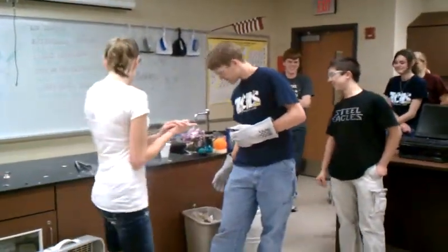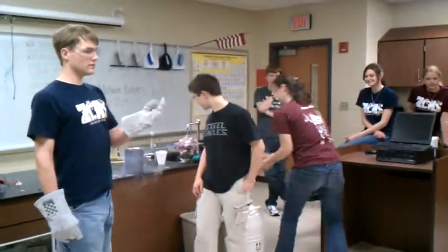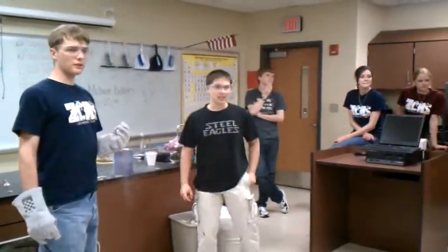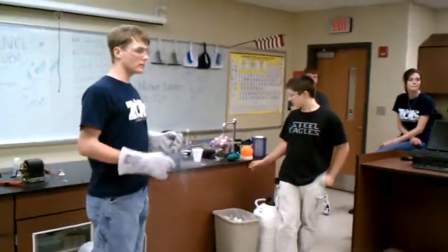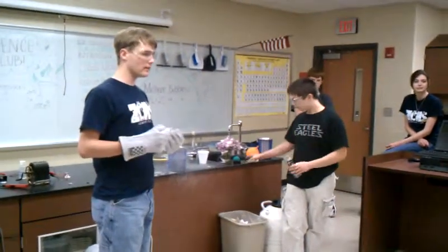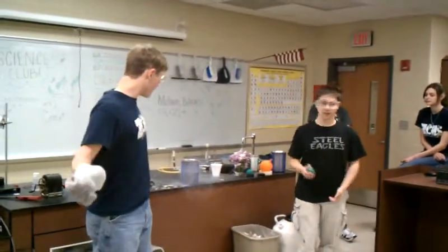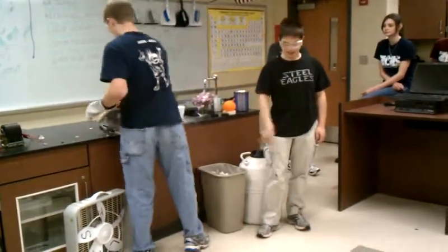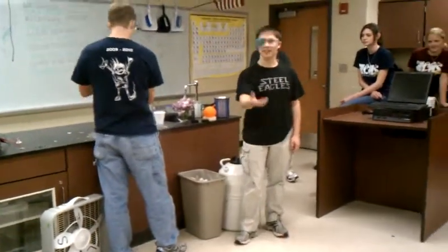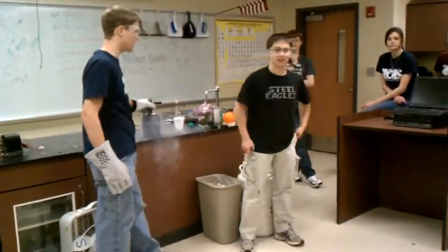All right. Can anyone explain why the flower shattered and did not bend or anything? Do you want to try, anyone? Well, if you remember, when things get colder, they become more brittle. And if you remember brittle when you were learning about metals, brittle is how easily they fracture instead of bend. So at cold temperatures, almost everything becomes more brittle and less ductile. Also happens with rubber. So you can see this racquetball, super bouncy, but when we throw it in liquid nitrogen, you can see what happens.